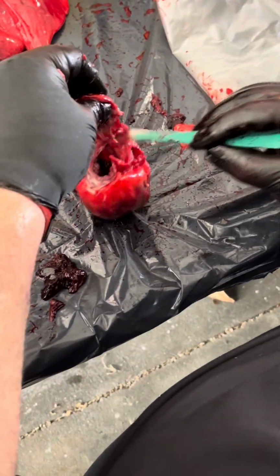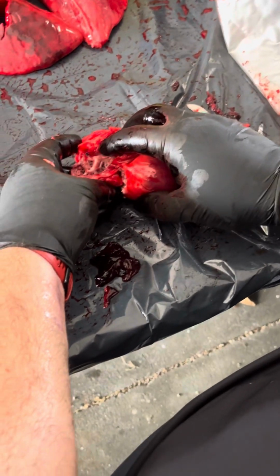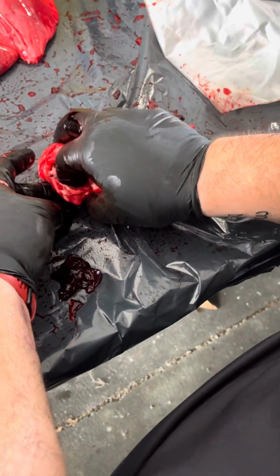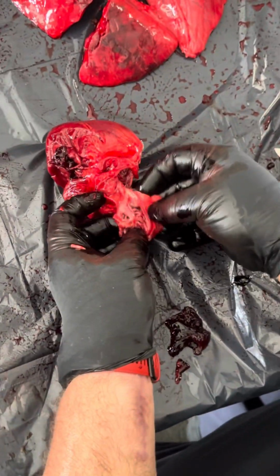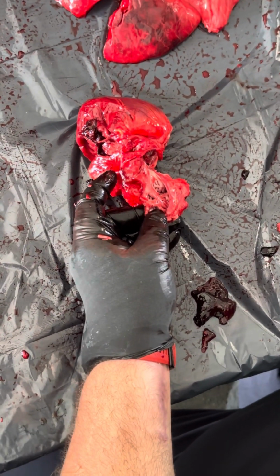So you said this is the left atrium. So that is the right ventricle and right atrium together. This is the inside of your left atria. Left atria, as you can tell, has a lot of pockets for blood clots to develop.